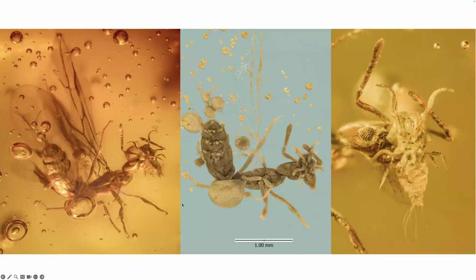It's really quite twisted in the rock. And then this in the middle is my interpretation in a 3D microtomography data set. Here's the scale of 1 millimeter. And it's really, really hard. So the weekend before last, we had an object that was pyritized in a mudstone matrix, which was not so difficult to segment at all. But here, the density contrast is very small. So that image took a lot of work.